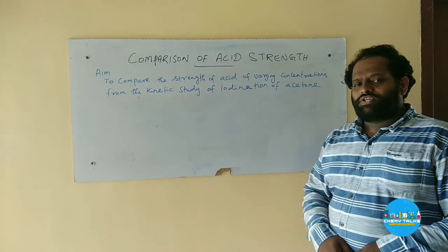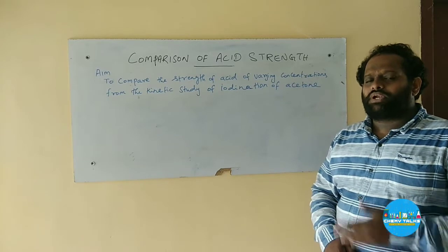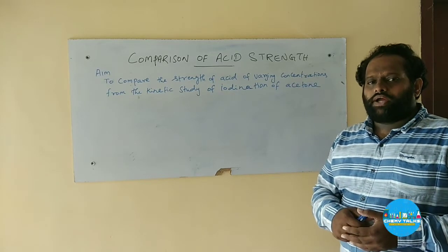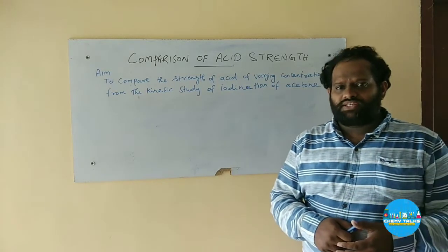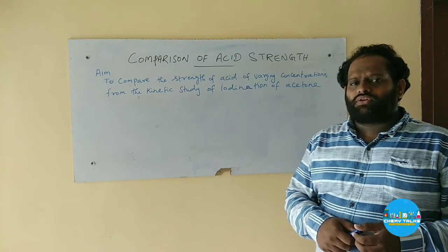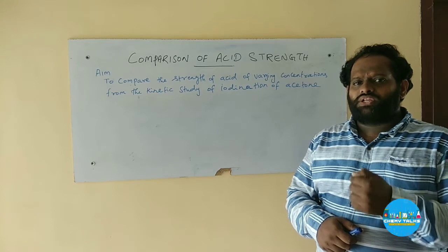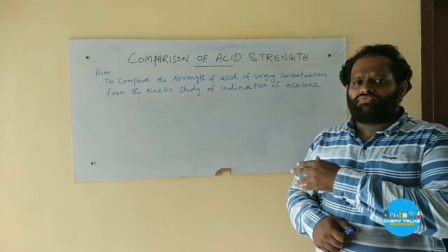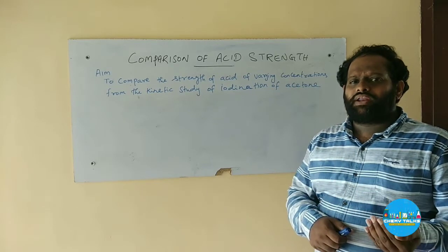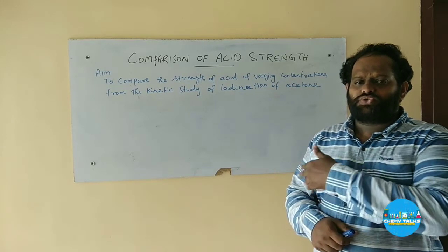Welcome friends. In this video I am going to discuss the experiment comparison of acid strength, iodination of acetone catalyzed by sulfuric acid. Varying the concentration of sulfuric acid will change the rate constant of the reaction. From the kinetic study of this reaction, we can compare the strength of sulfuric acid used in this reaction.